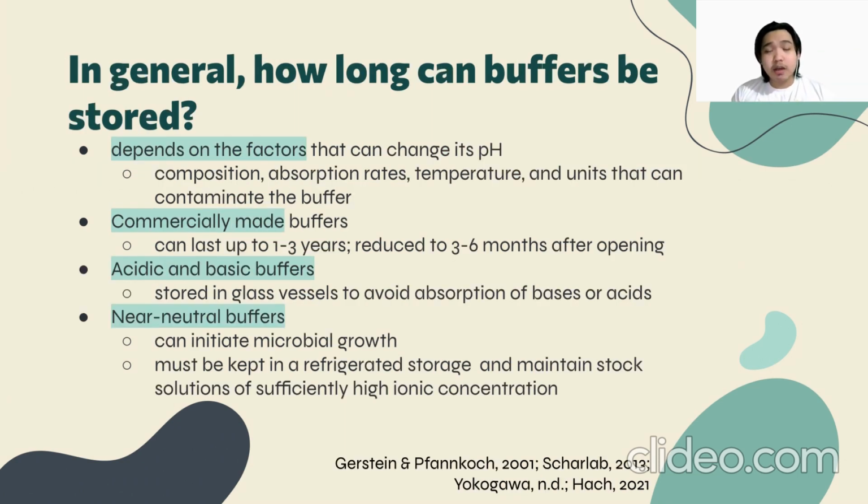Lastly, in general, how long can buffers be stored? The shelf life of buffers depends on certain factors that can change its pH, such as its composition, absorption rates, the temperature of the storage, and other units that can contaminate the buffer. Commercially made buffers must be stored according to the instructions provided. It can generally last 1 to 3 years from its manufacturing date, which is then reduced to 3 to 6 months after opening. Acidic and basic buffers, on the other hand, must be properly stored in appropriate glasses to avoid the absorption of bases or acids that could contaminate the buffer. However, near-neutral buffers are prone to microbial growth, especially those that contain phosphates. To avoid this, the buffer must be kept in refrigerated storage and stock solutions maintained at sufficiently high ionic concentrations.